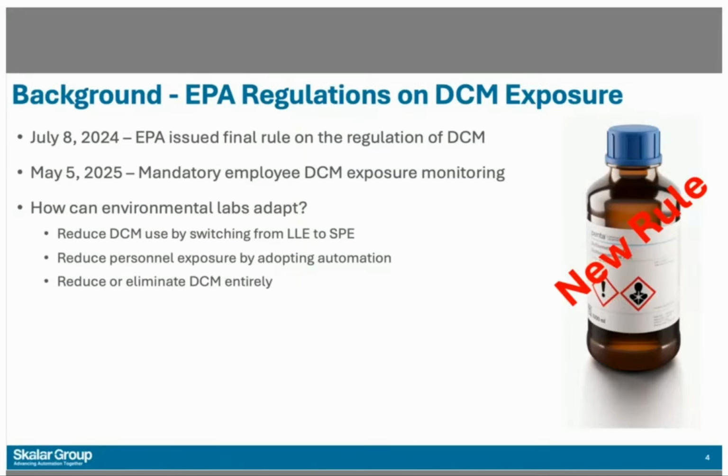And then, you know, I was thinking back to earlier in my career, I did a few courses in occupational hygiene, and for exposure reduction, a couple of measures like PPE, administrative controls, engineering controls are helpful, but the real, of course, ultimate solution is elimination.